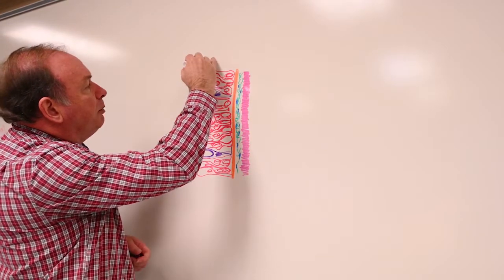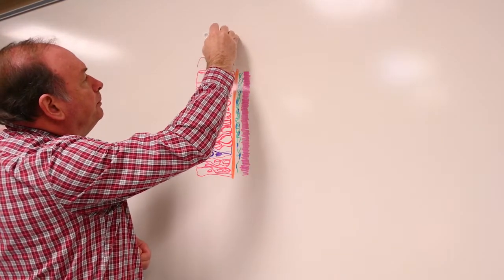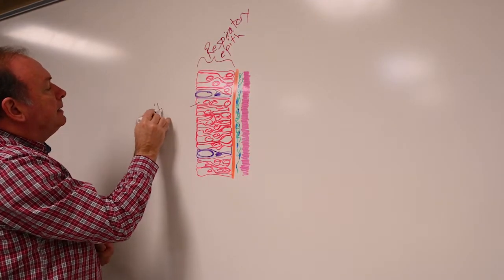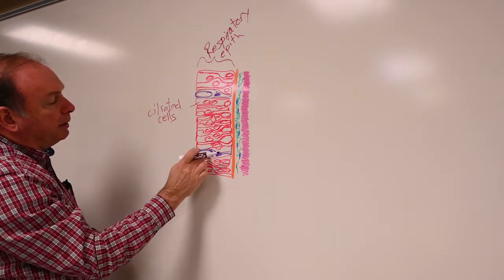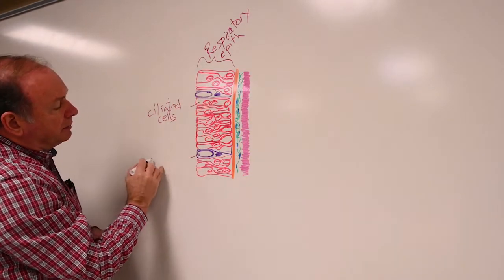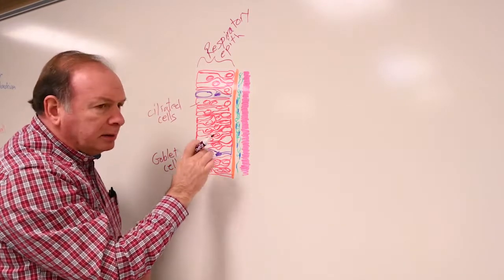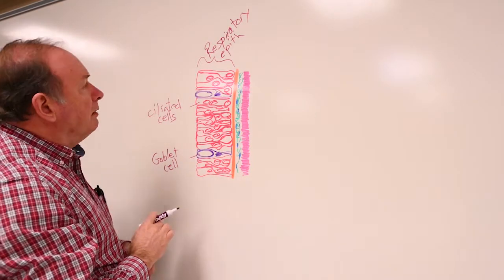So all this out here would be a respiratory epithelium. It consists mainly of ciliated cells, and these dark purple ones represent goblet cells. They have these large mucus masses out here near their surface. Often those mucus granules are divided up into little bubble-like masses within that outer space of the goblet cell.